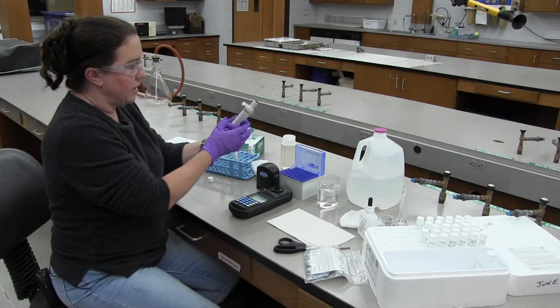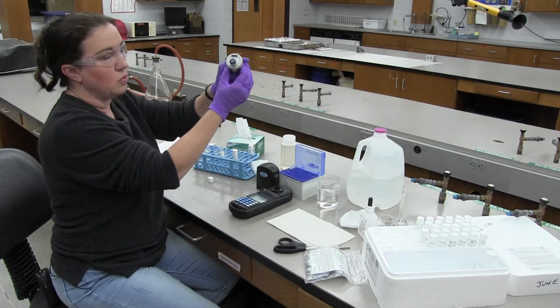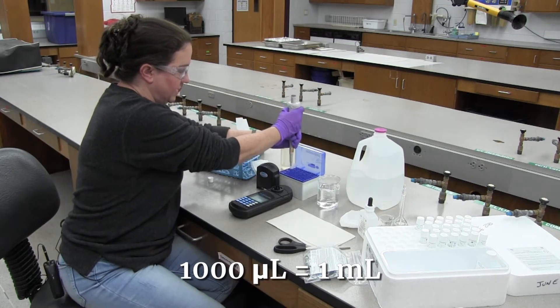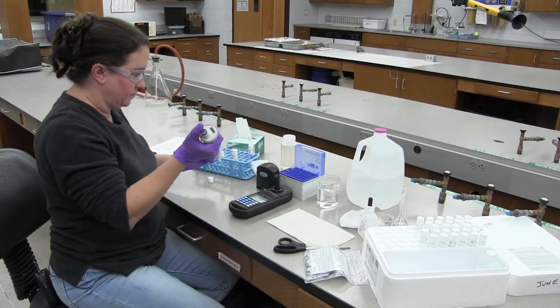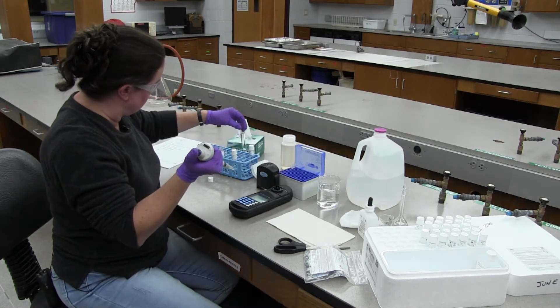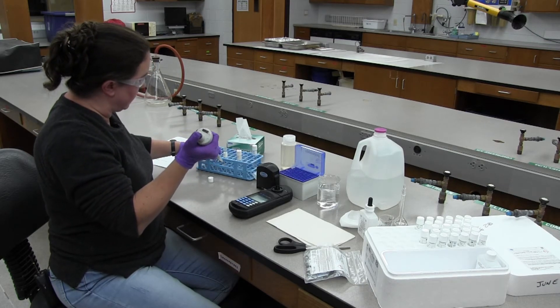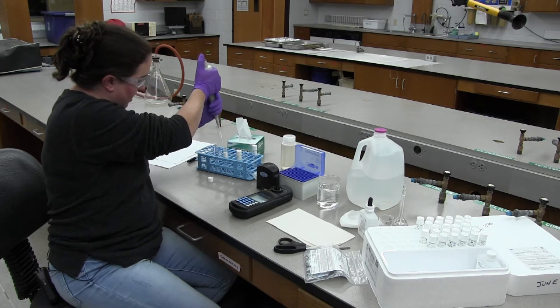I have a micro pipetter here set to 1,000 microliters. I'm going to put a micro pipette tip on the end. Now I'm going to use my standard — the 2 milligram per liter that I'd already made up. We're going to pop 5 mils into our testing tube.